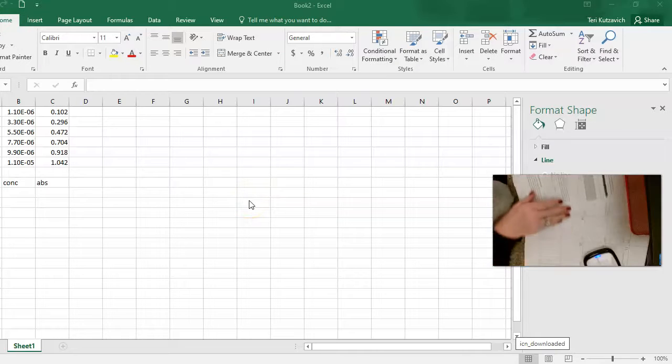Hey guys, we're going to be doing another kinetics, well, I guess not another one, just a kinetics experiment. And there's some things that you may not know, so I just want to go over some things with you. You're going to be watching a video, and the guy's pretty good at explaining everything, and he does all the lab work for you.